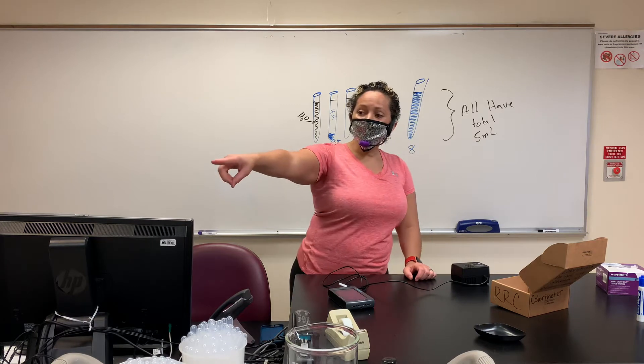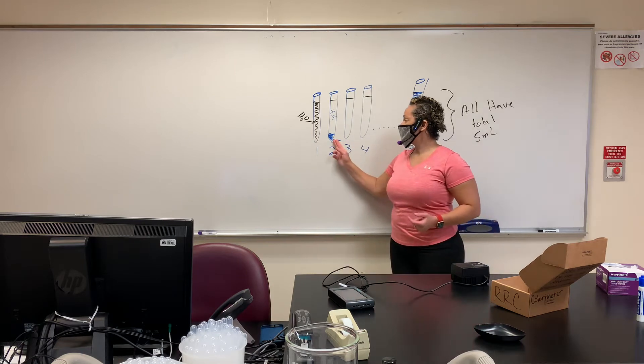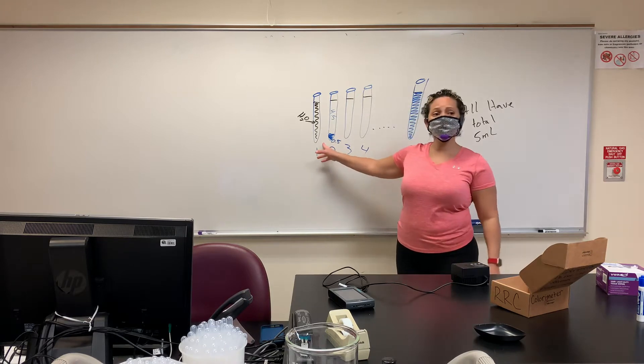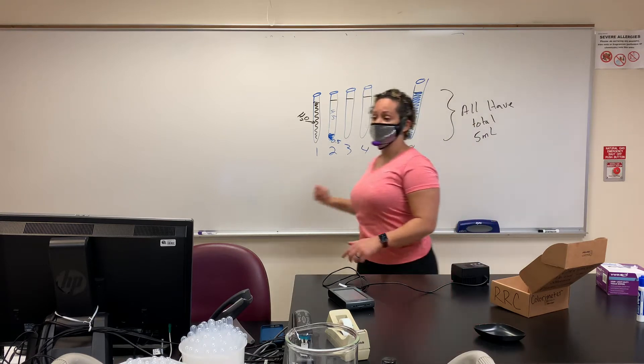As you can see, you've made your blue things. We have several levels from the darkest blue to the lightest blue and to water being clear. This has zero absorbance. This is going to be the most absorbance, and you should see your numbers stepwise going up.